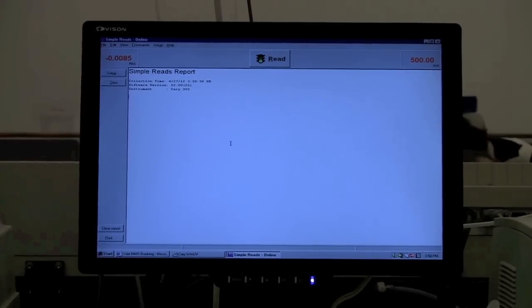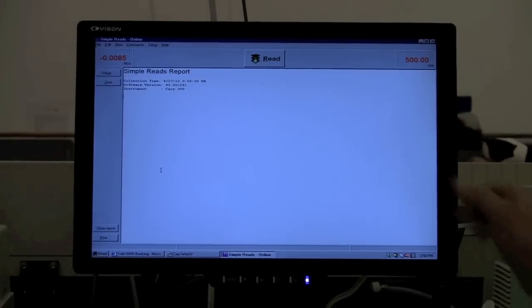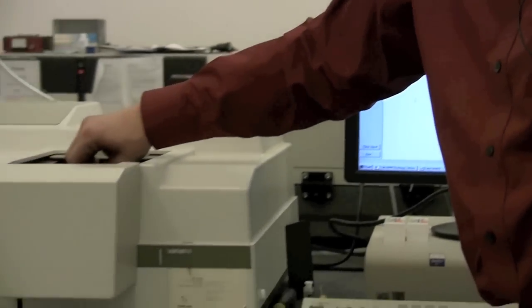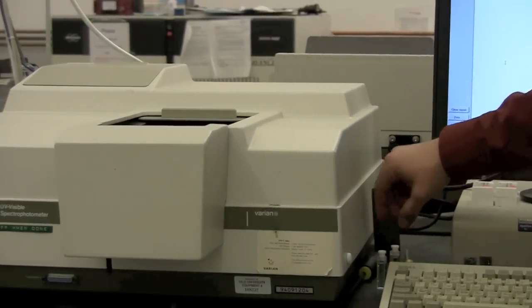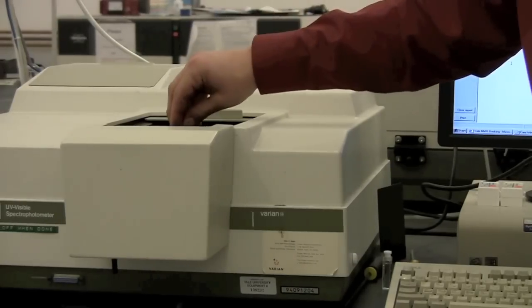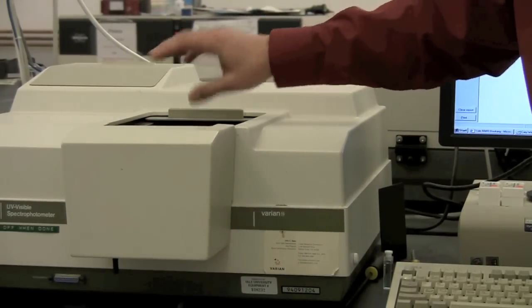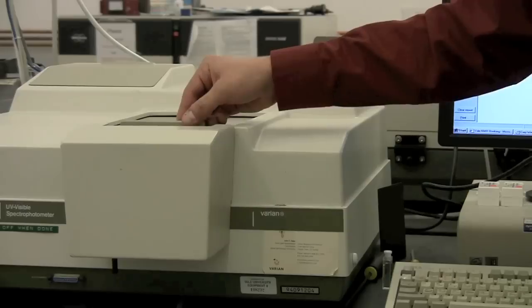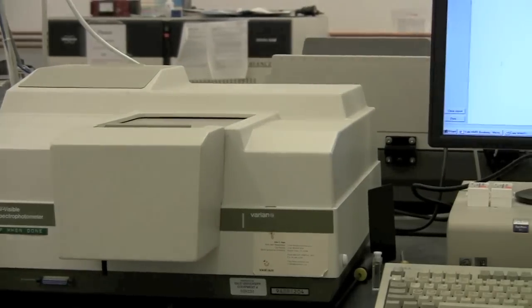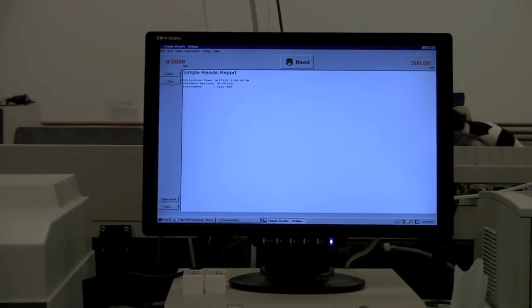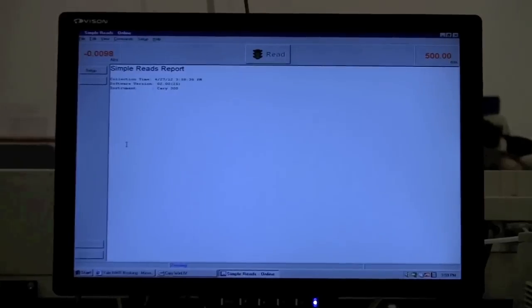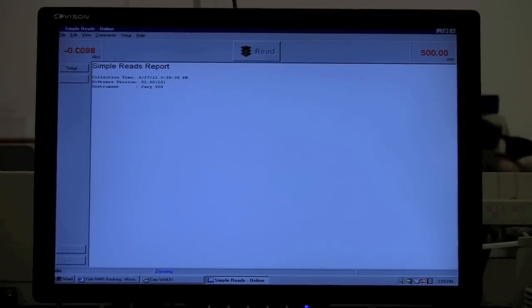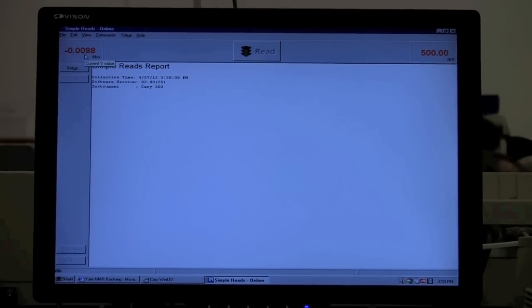So to use the Simple Reads, what you would do is you would put in your blank sample, which would either be an empty cuvette or a cuvette with the solution, but not whatever material is absorbing. So just buffer, for example. And then you can zero it. And the absorbance should go to zero.